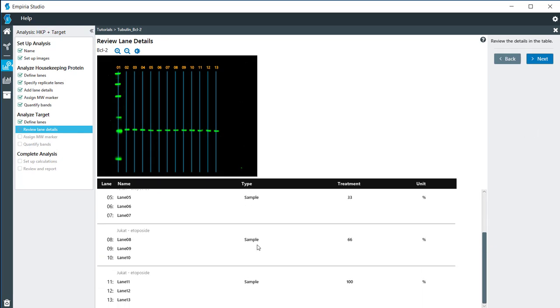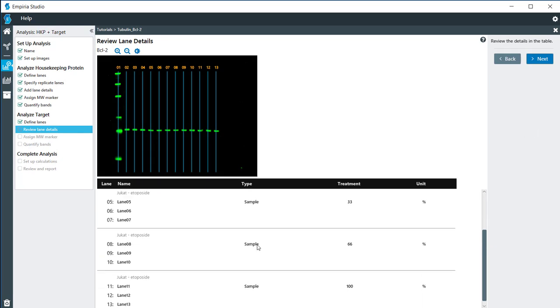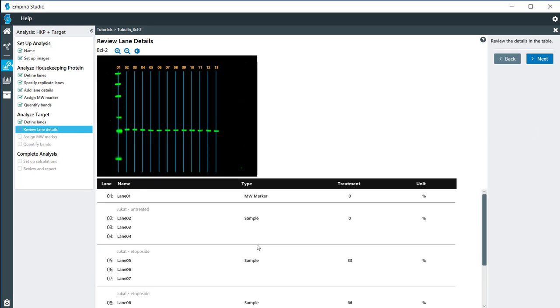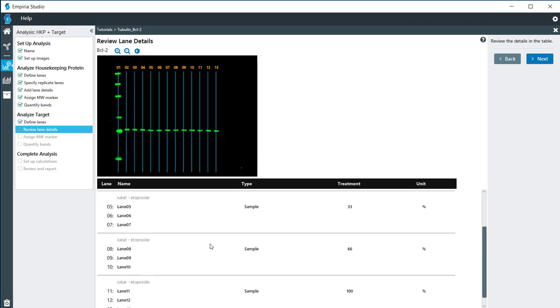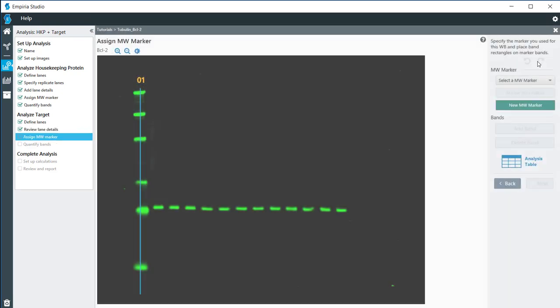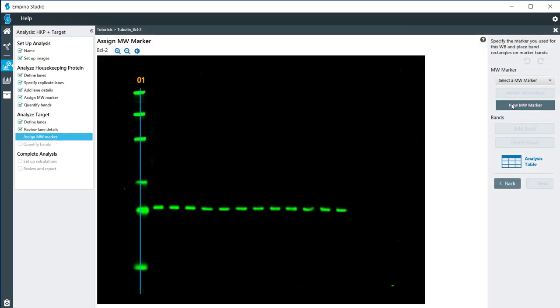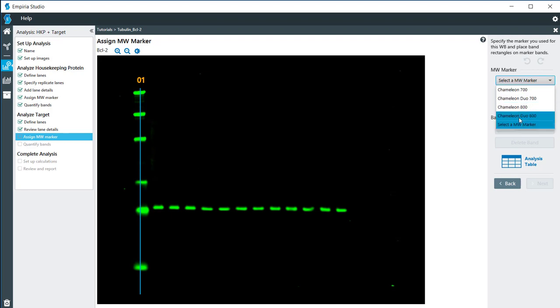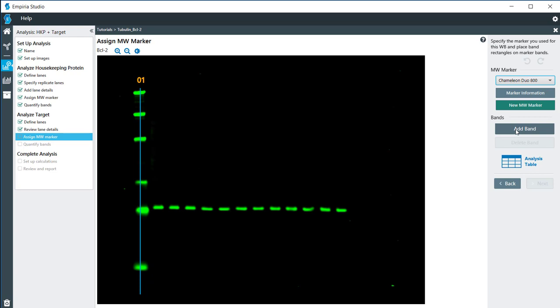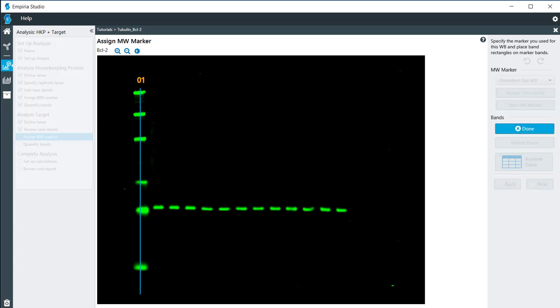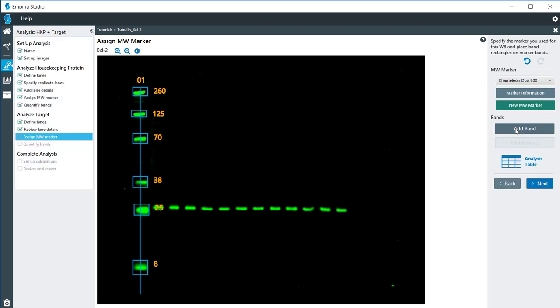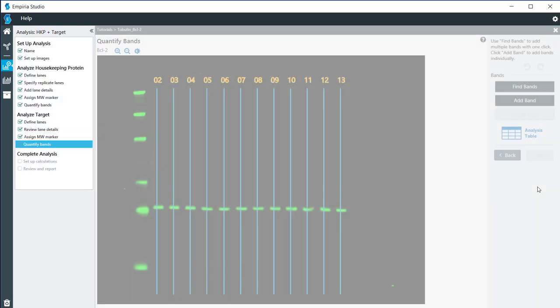Now everything is carried over from the previous information, so this is just so that you can take a look and make sure everything is correct. For my molecular weight marker, I have the Chameleon Duo 800. I'm going to add bands to this, and then click done, and then next.